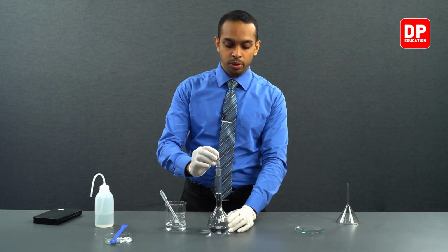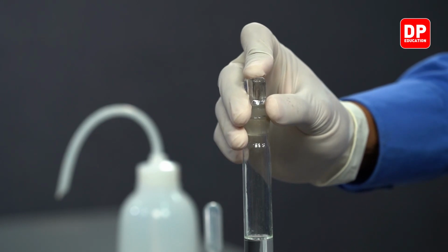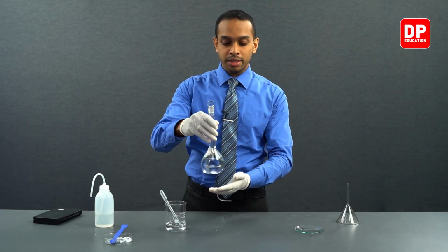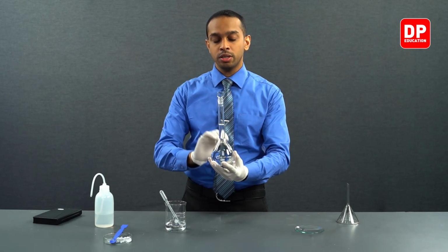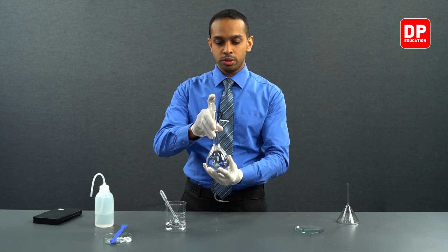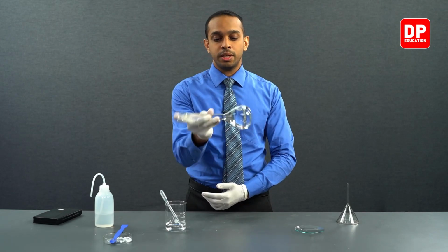We have to close the stopper quite tightly, making sure there won't be any spillage. And then you can start mixing it around, but since there's a lot of water filled over here, the best way to mix it is to close the stopper really tightly and then turn this volumetric flask upside down.